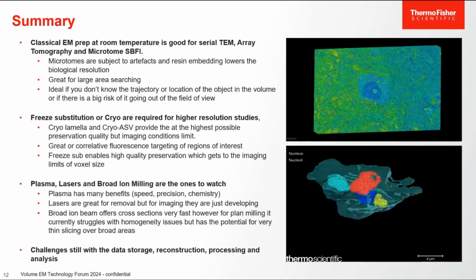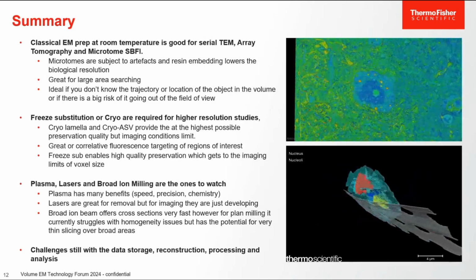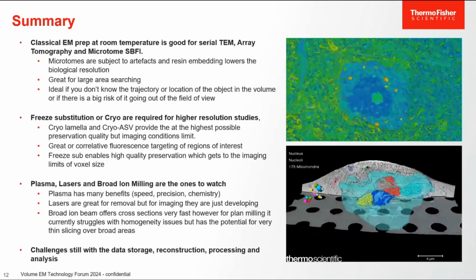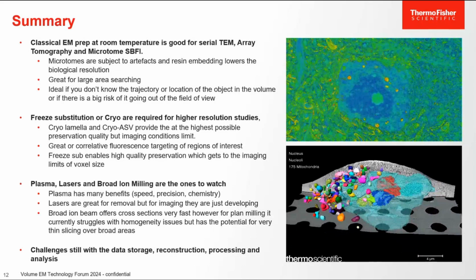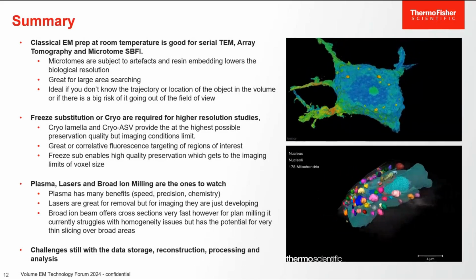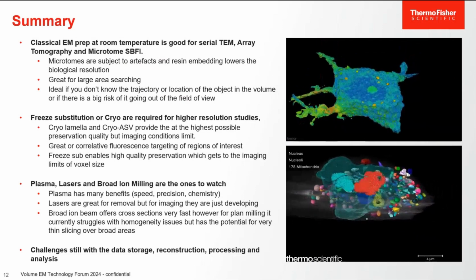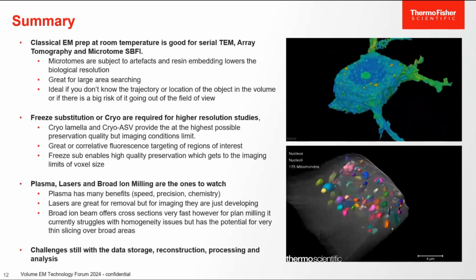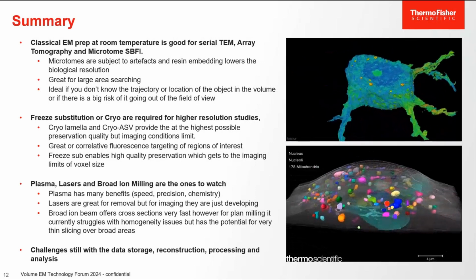But really, we're seeing the main challenges with things like data storage, reconstruction, and processing. So for us, that's the big bottleneck that we're still seeing. So I'm really encouraged by everybody's work that I've seen presented at other meetings this summer, which are making it a lot easier to visualize. Okay, so with that, any questions?